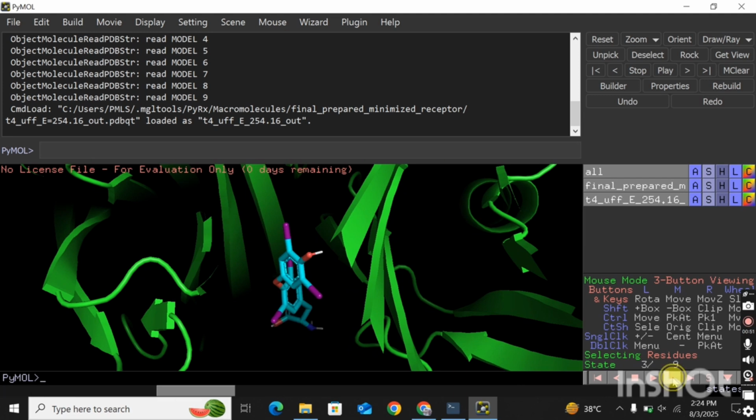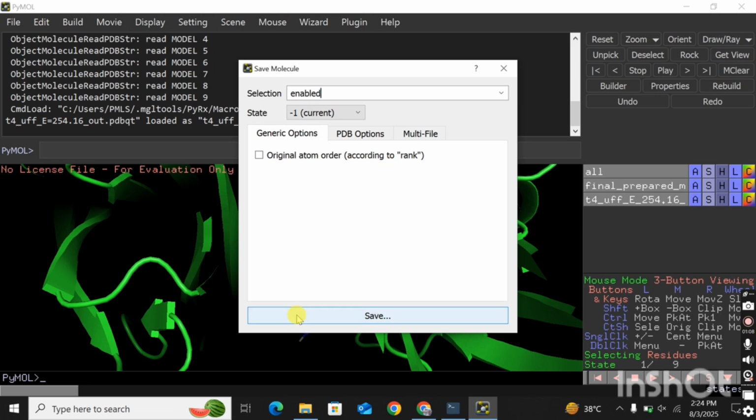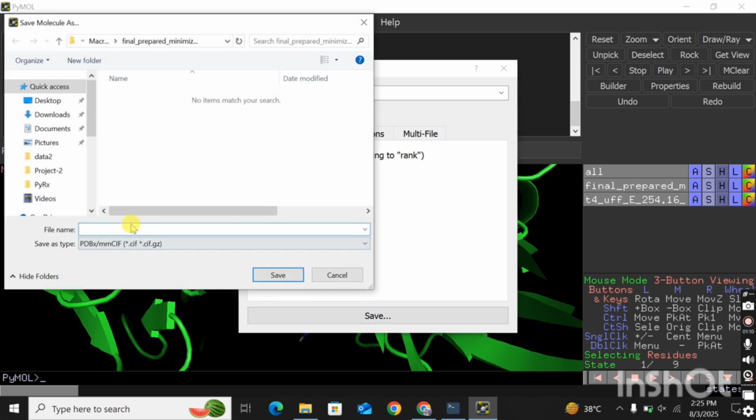Okay, now you run. Now you can see that the ligand moves in that grid. All the poses are in that specific grid. The ligand does not move outside this area, which is our grid setting, grid conformation, grid dimensions. Save your file in the PDB format.